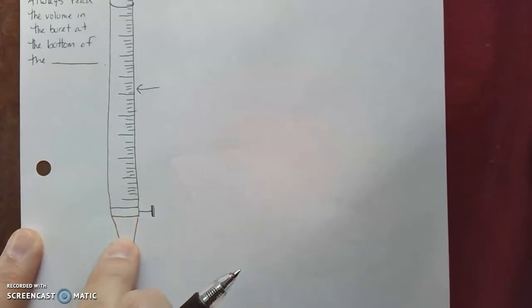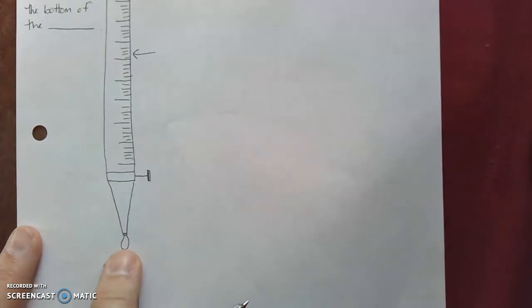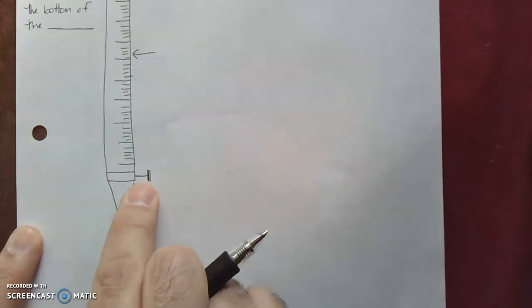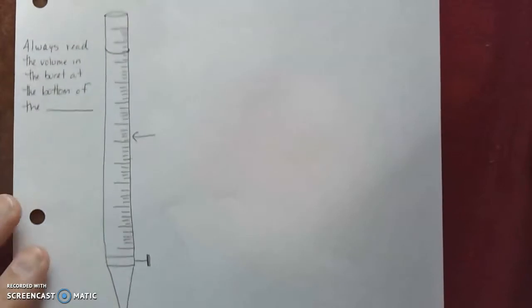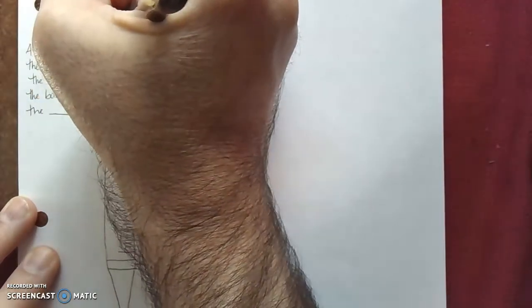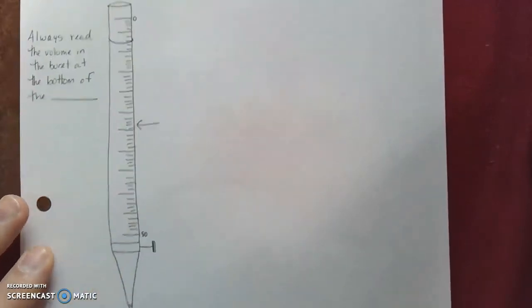There is a very small hole that drains down to a point, and you can control the amount of solution that's in the burette drop by drop if needed, but it does come out in a very small stream. By turning the valve, you can open and close the burette, but you can also control how fast the liquid comes out.